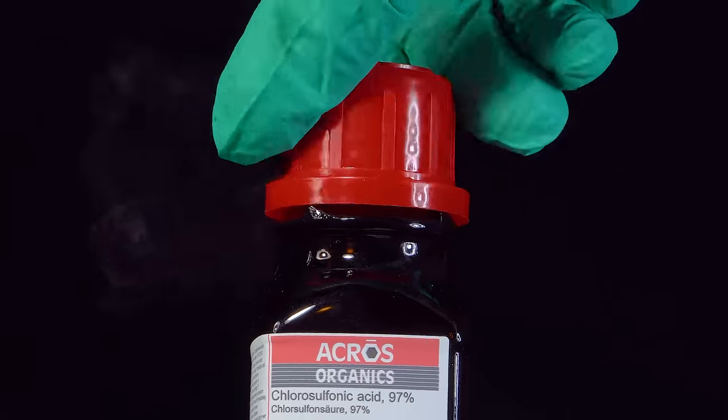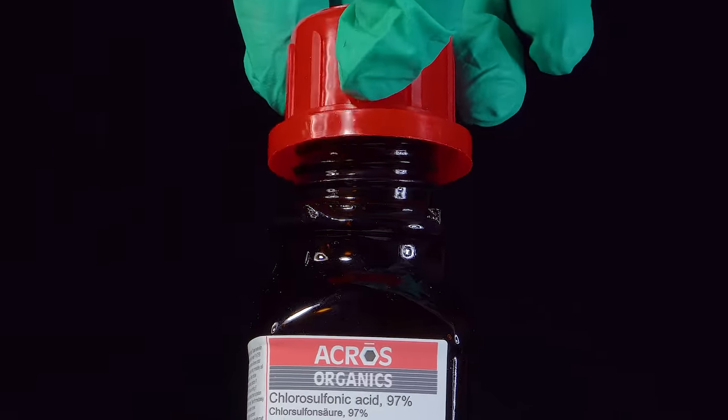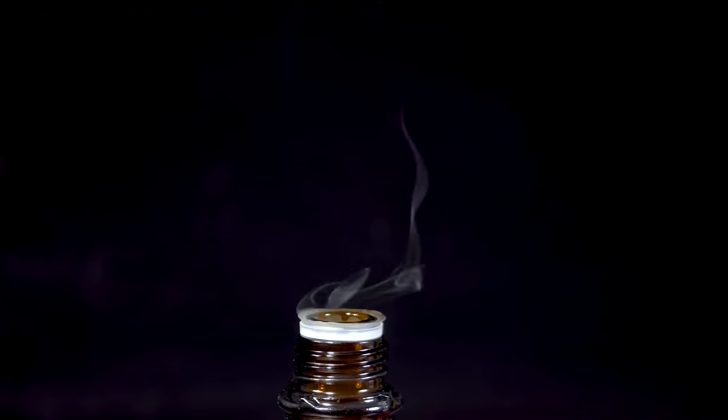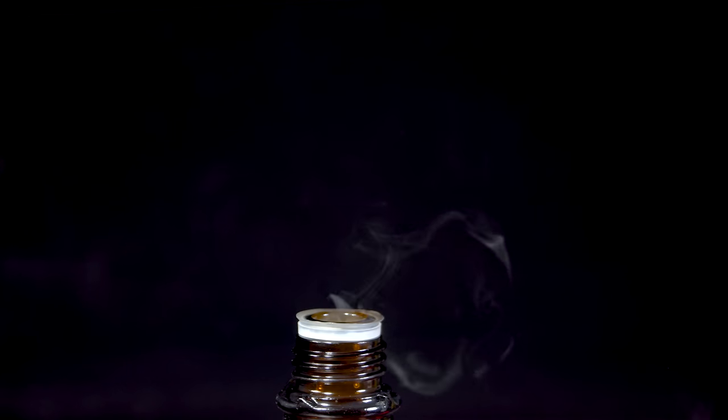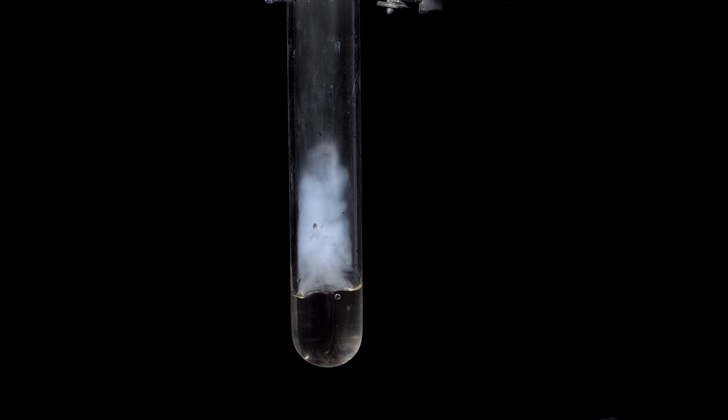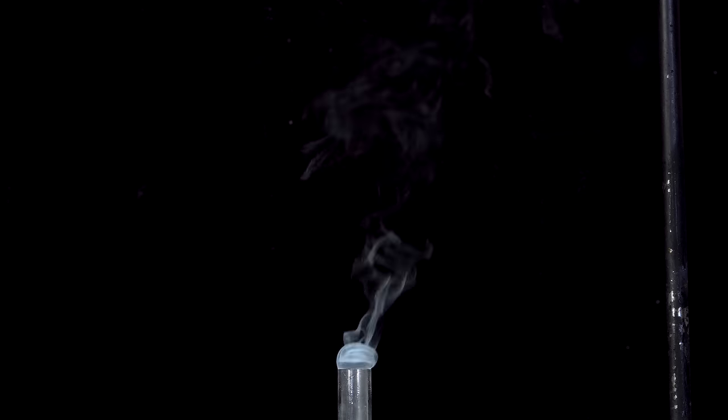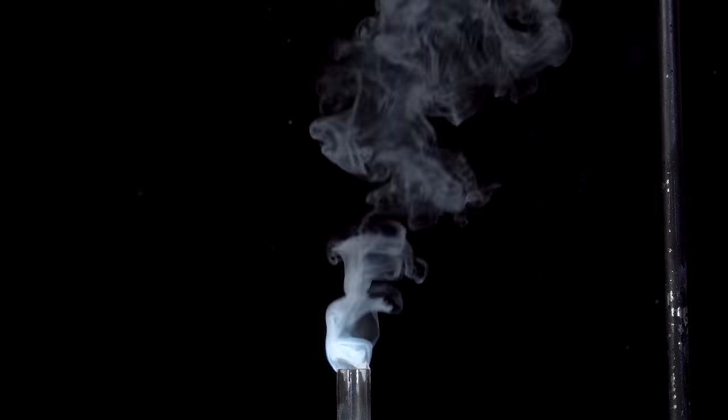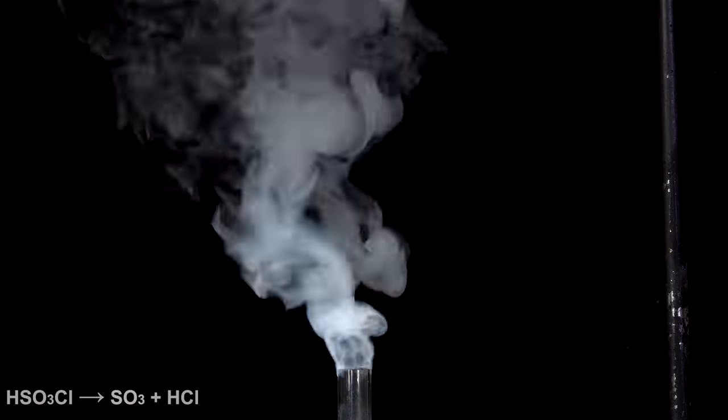In air, this acid fumes, forming the mist of sulfuric acid and hydrogen chloride. If you heat this acid to the temperature above its boiling point, it will form a much more poisonous compound called sulfur trioxide. Just a tiny bit of chlorosulfonic acid is able to create a great amount of poisonous fume.